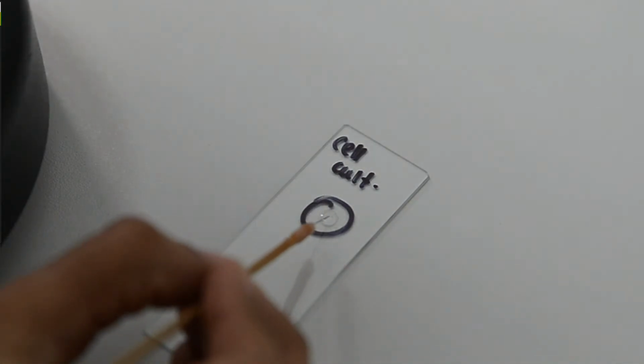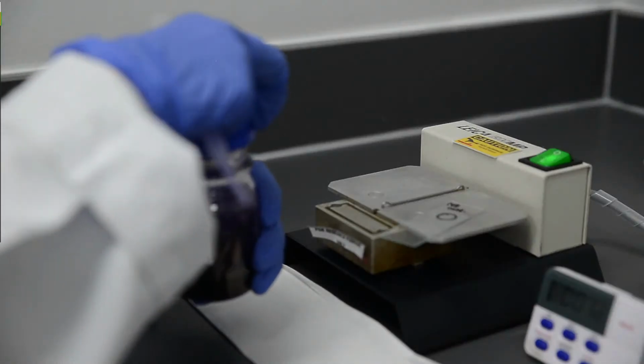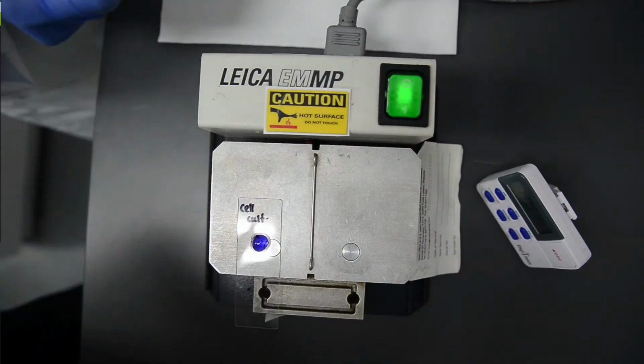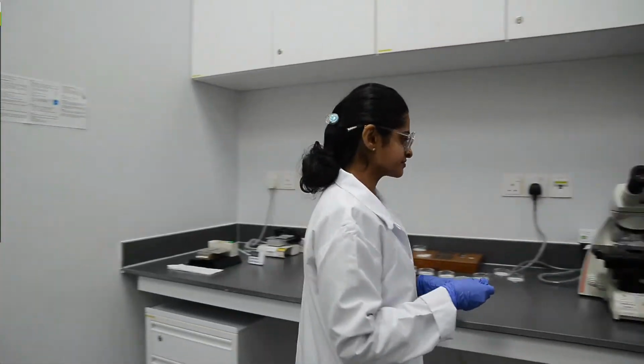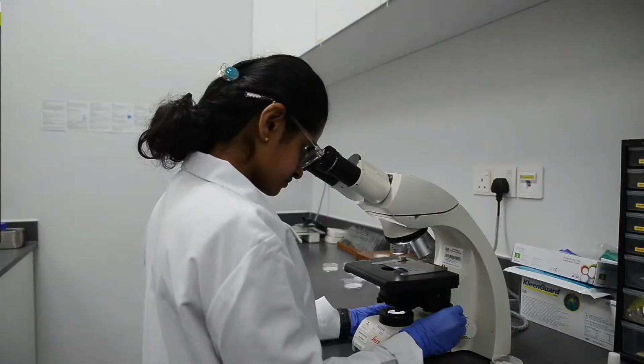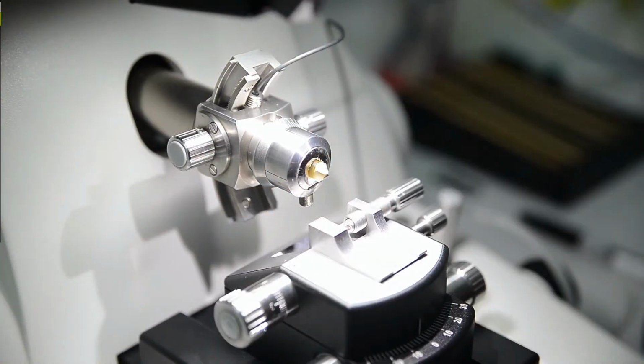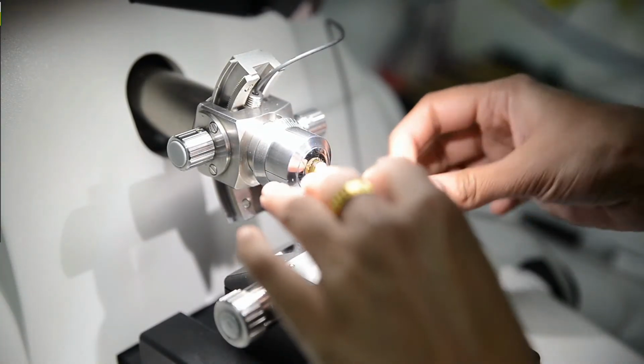This process is to confirm the sample is neat. And now it's ready to view under the microscope, and this is the outcome. Once we confirm the sample, we proceed to the diamond knife.